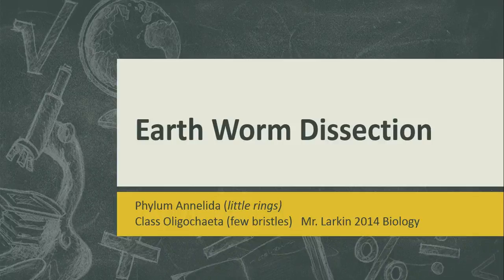As you already know, you will begin your earthworm dissection starting on Monday. This presentation has been designed to prepare you to begin your exploration of the anatomy of the common earthworm. You will work with your lab partners, and you will be expected to identify and describe the appearance of key anatomical structures. You will collaborate within your group to draw these structures and use these drawings to help you with the quiz at the end of the dissection.